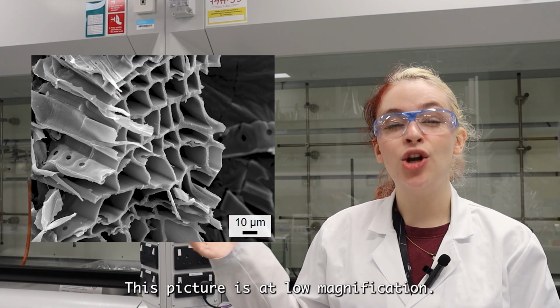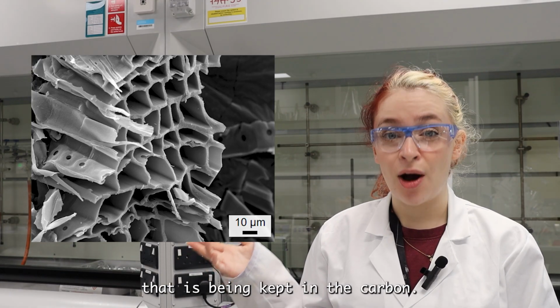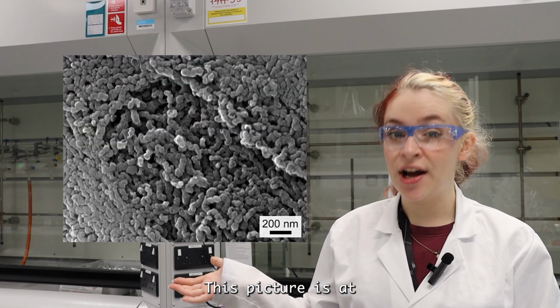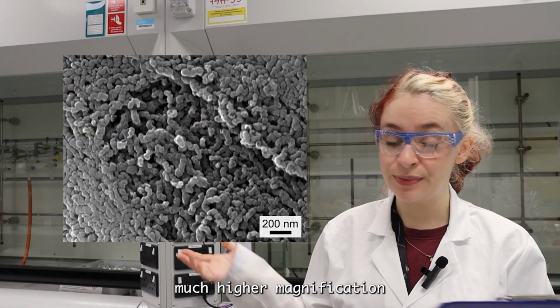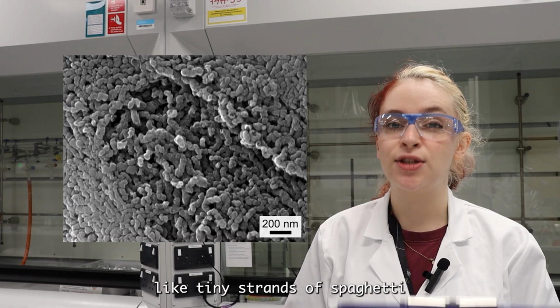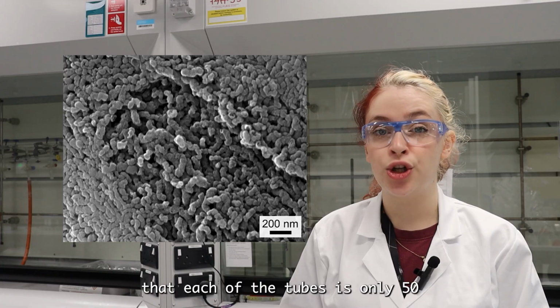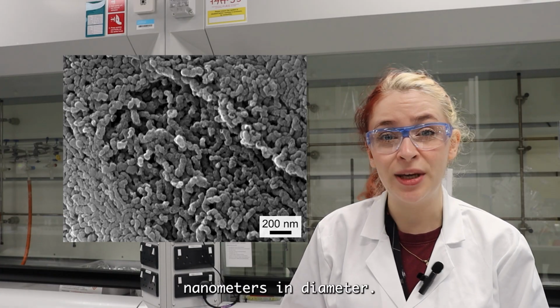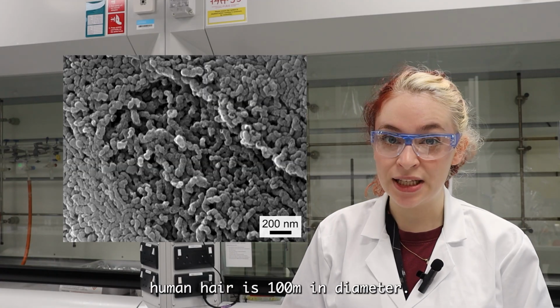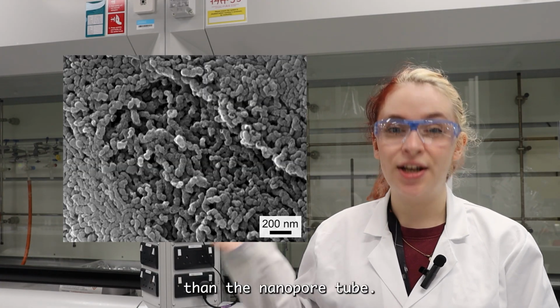This picture is at low magnification. It shows the structure of the wood that is being kept in the carbon. The tubes are what the tree uses to transport fluids. This picture is at much higher magnification, and it shows the tiny carbon nanotubes looking a little bit like tiny strands of spaghetti all tangled together. You can tell from the scale bar that each of the tubes is only 50 nanometers in diameter. An average human hair is 100 micrometers in diameter, so that's 2,000 times larger than the nanotube.